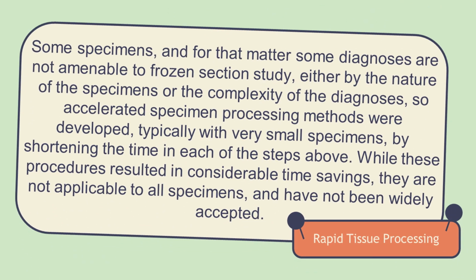Some specimens, and for that matter, some diagnoses, are not amenable to frozen section study, either by the nature of the specimen or the complexity of the diagnosis. So accelerated specimen processing methods were developed, typically with very small specimens, by shortening the time in each of the steps above. While these procedures resulted in considerable time savings, they are not applicable to all specimens and have not been widely accepted.